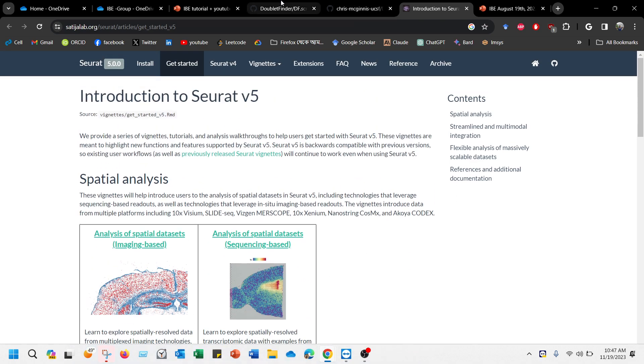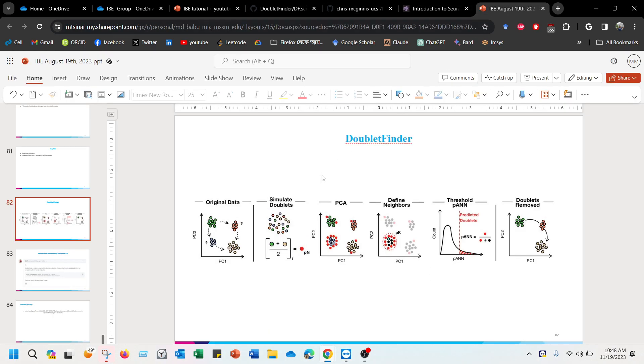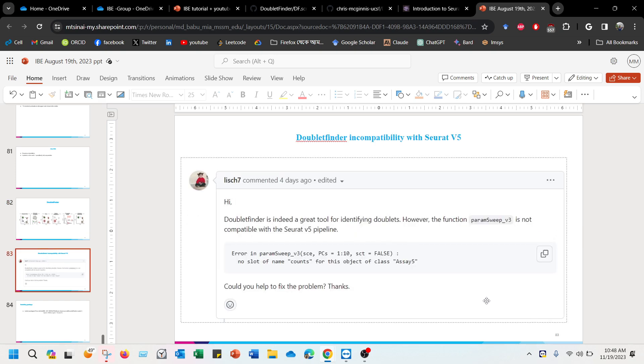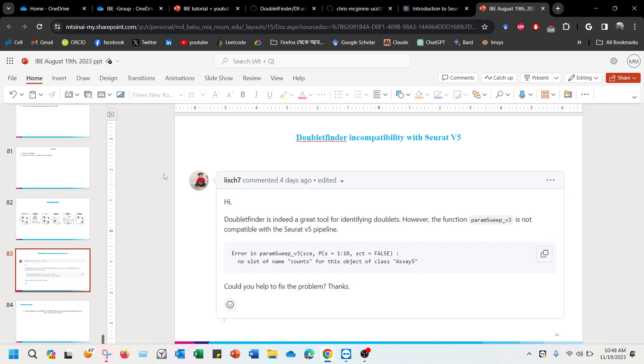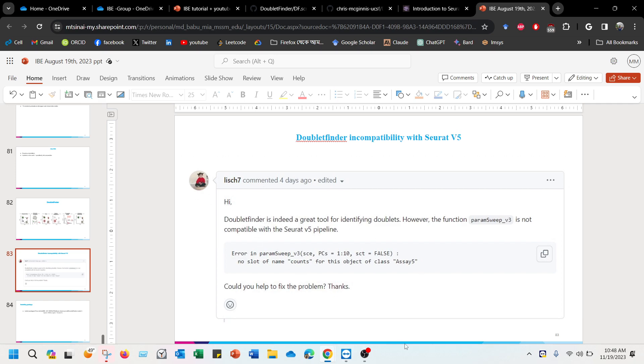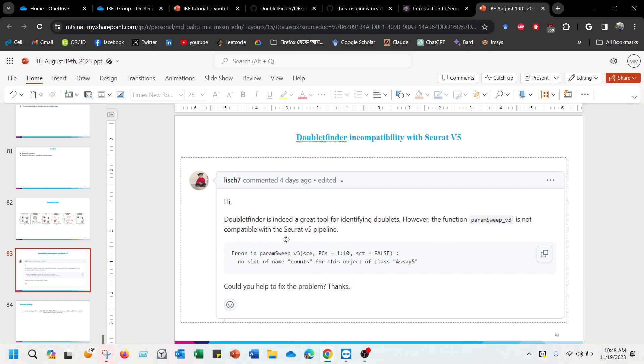Unfortunately, version 5 has some sort of incompatibility with the Doublet Finder, which is expected because each version has changes. And there is a user named list7_nicknamed that reported there is an error in terms of param sweep version 3 with Seurat version 5 pipeline.